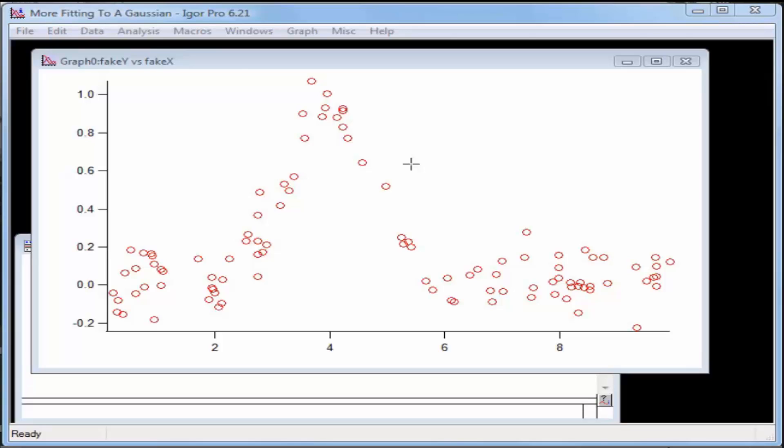The graph window shows a fresh graph of the fake X and fake Y synthetic data. Select the Analysis Curve Fitting menu item.